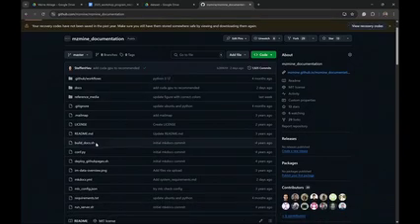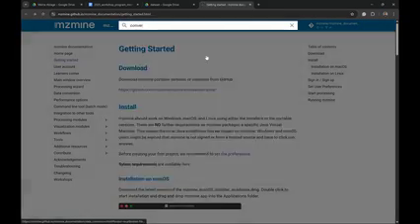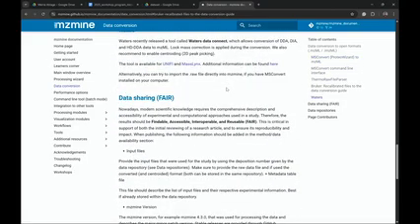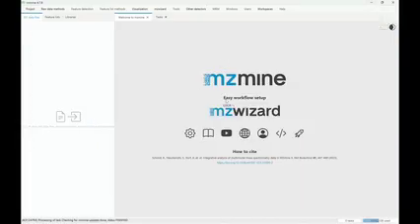Because the documentation is just written in Markdown, you can always go and propose some changes. Let's say you find that your data needs to be treated differently, for example data conversion. There's something in the documentation already, so you can search for data handling, data conversion, supported formats, and then there are different sections on different data files and maybe some issues. If you find something, just propose a change and add it to the documentation. It's a community effort.